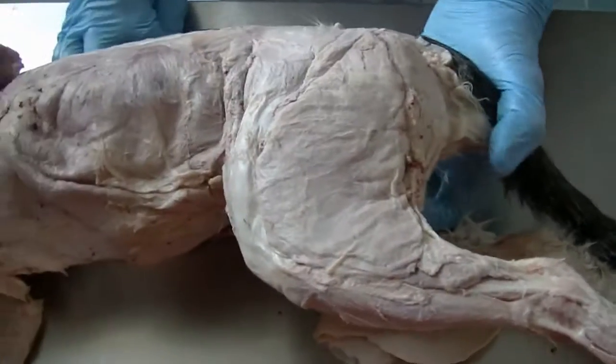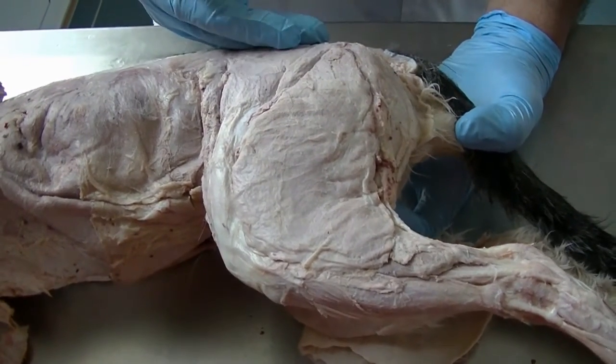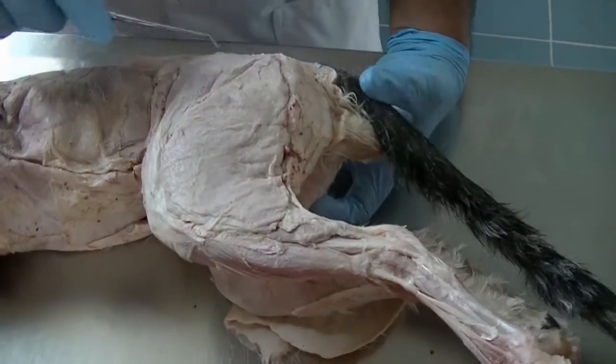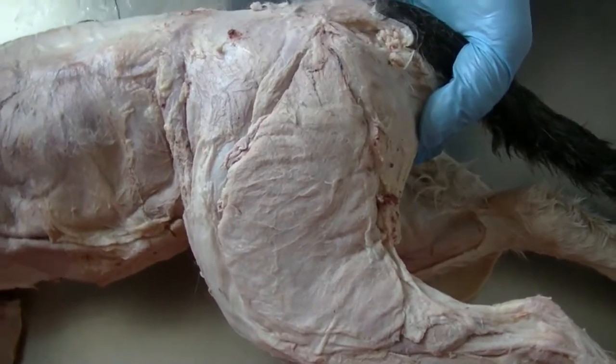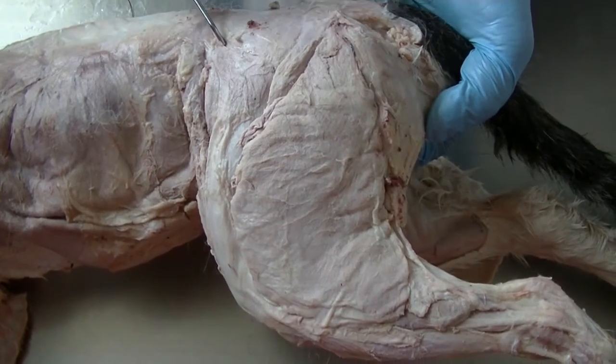Hind limb. So this is our gluteal region, the lateral aspect, lateral view of the hind limb, cranial, caudal, limb. From the lateral view, we can see the gluteal region. Here we see some of the muscles are still covered by the gluteal fascia, but we can easily separate their borders and we can expose them very quickly.